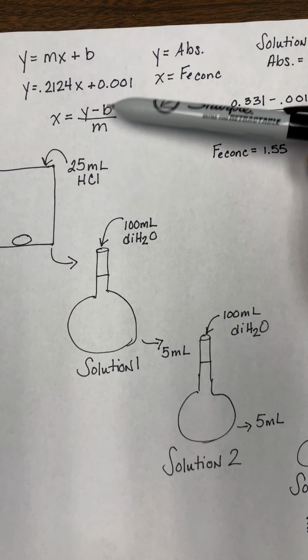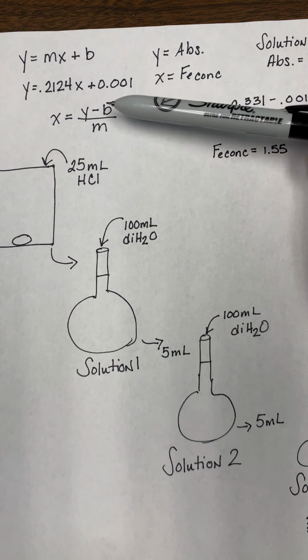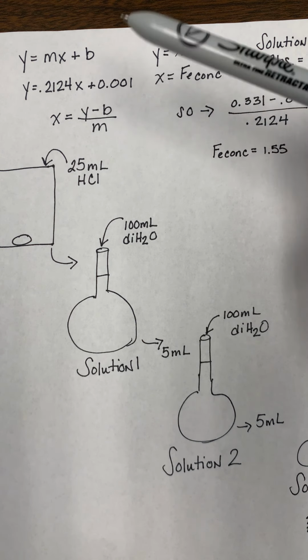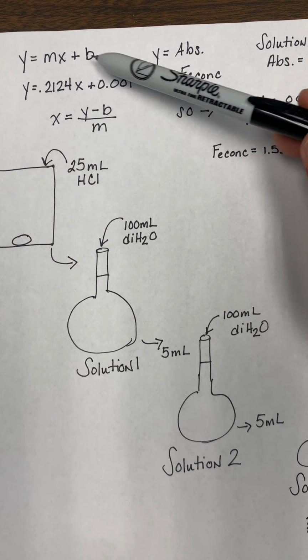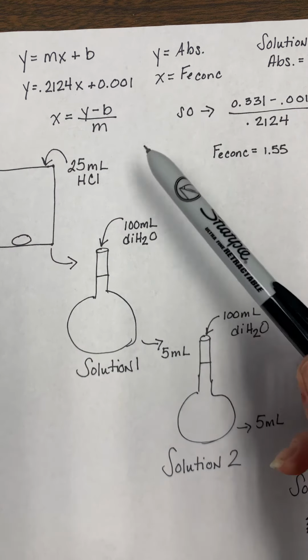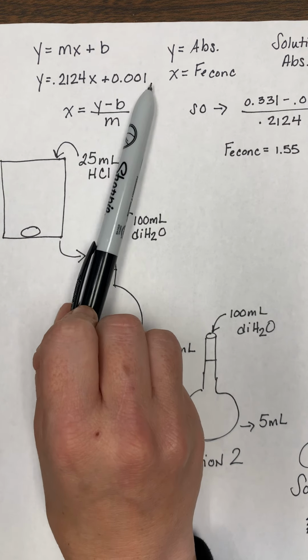I made these numbers up. These are not necessarily the numbers for our standard curve that we're using. So if I figure out my standard curve and I'm given an equation, it'll populate on the graph. So let's just say this is my equation, okay?